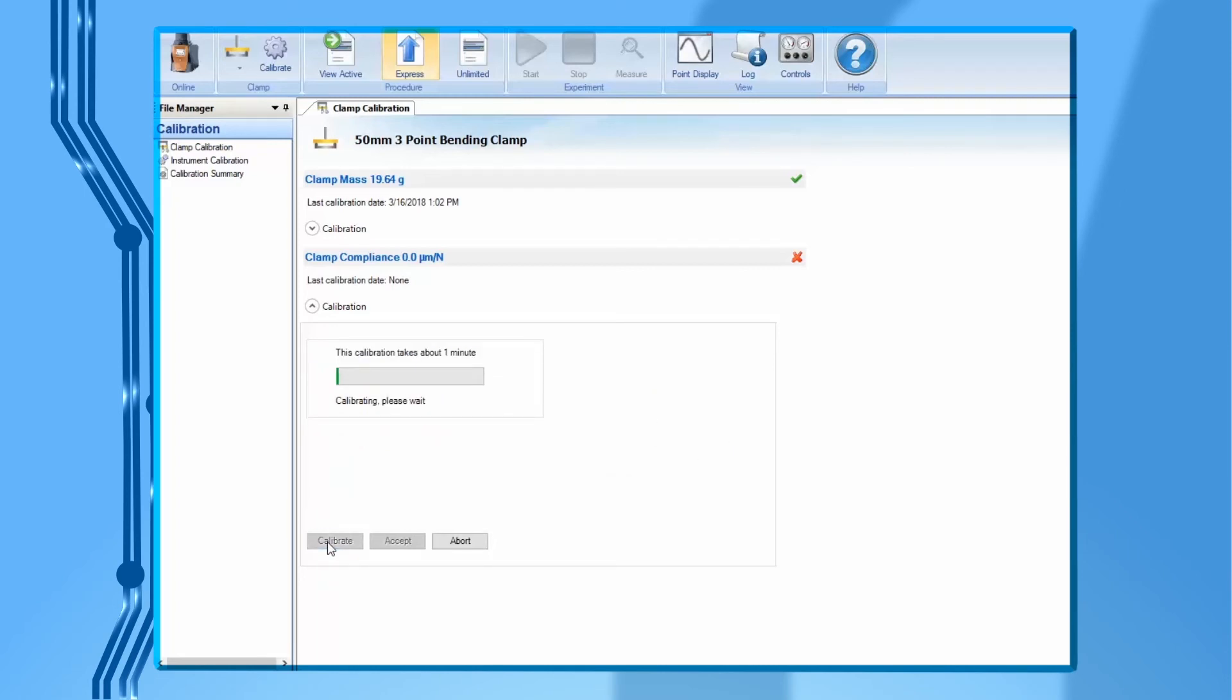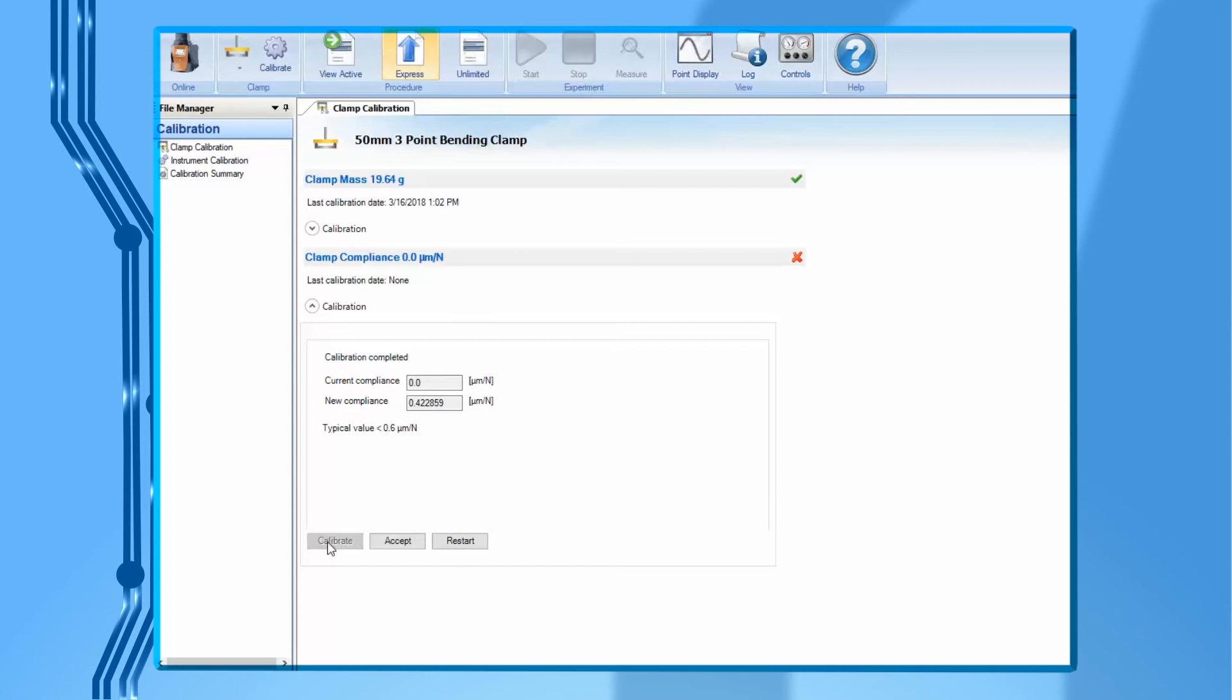This calibration step will take about one minute. If the calibration is finished normally, the compliance value should typically be lower than 0.6 micrometer per newton. Click on accept to finish the calibration.